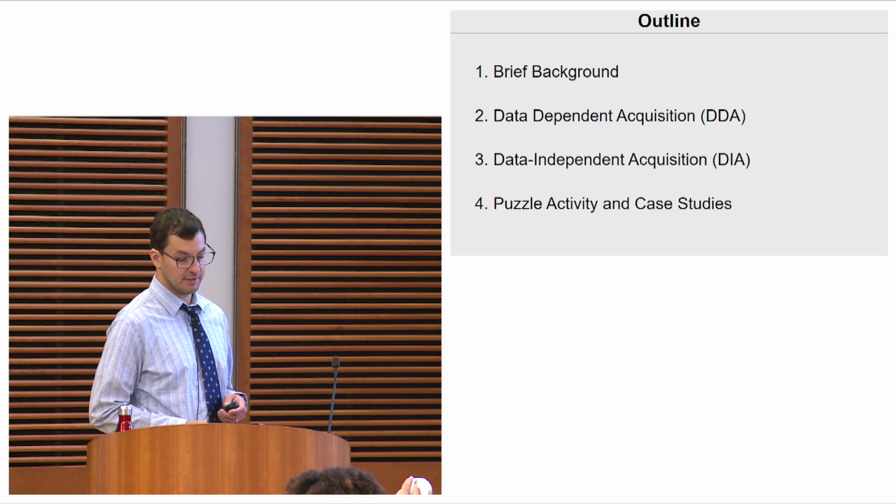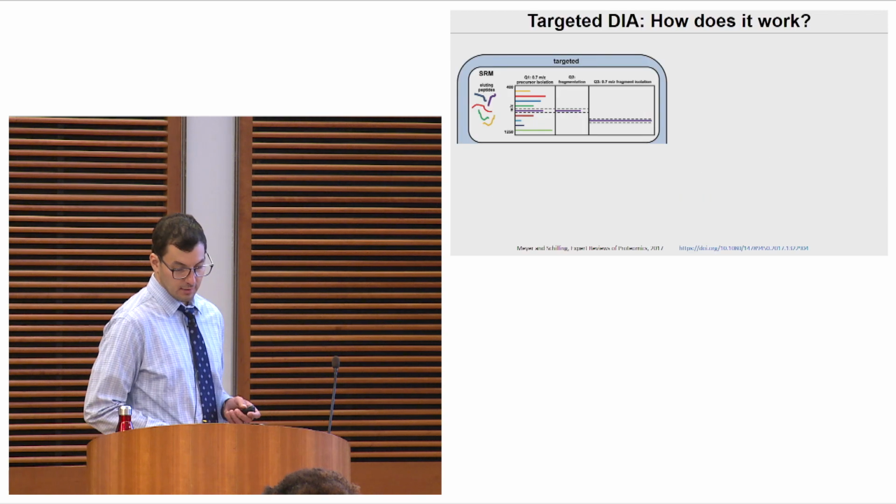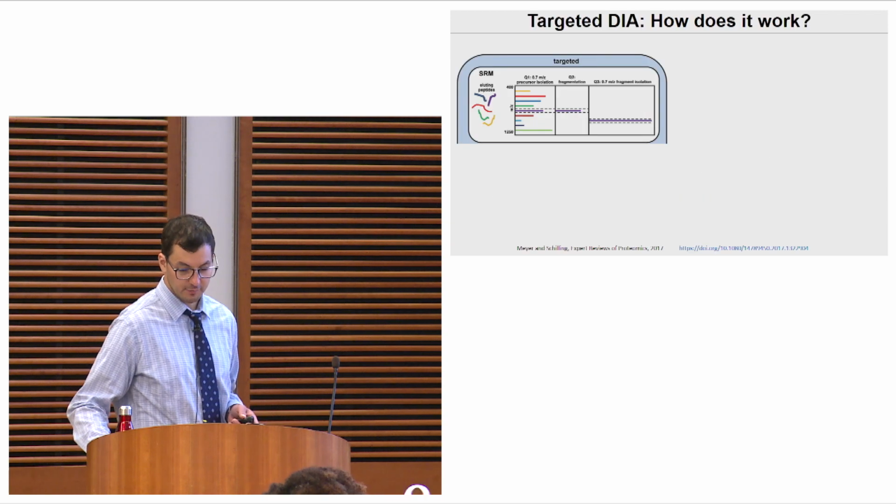Great, so that's it for DDA. Now let's talk about DIA. And we're perfectly on time. Starting with targeted DIA, how does it work?